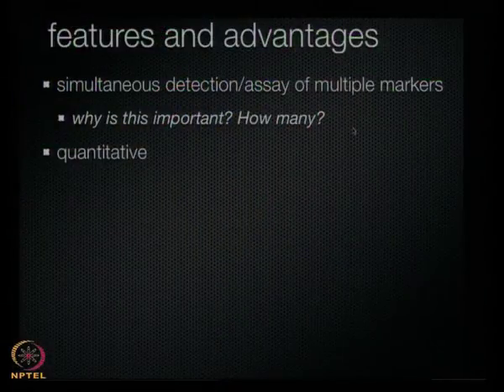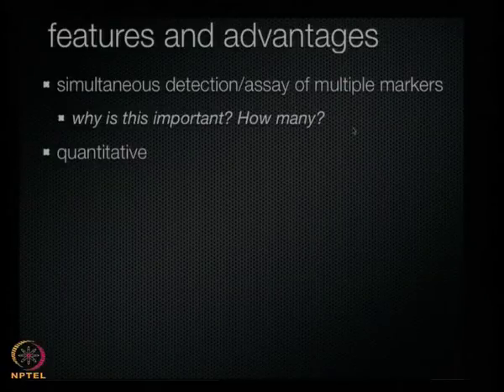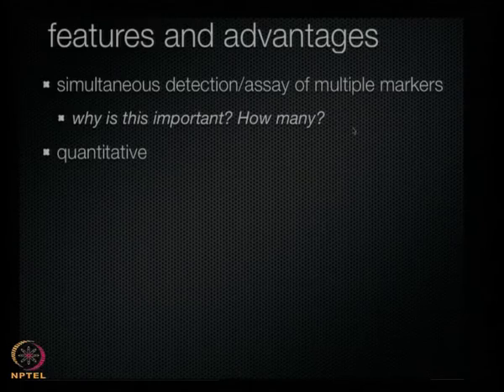Sure. So the approach is also quantitative, because, of course, the intensity of the signal is proportional to the amount of the material that's gone down. And of course, you have to run calibration curves to keep the standards going. As we mentioned earlier, there are few false positives, because if things don't fall down on a grating, then it's just not going to be measured. And the information is real-time. Again, that's characteristic of all label-free techniques. It's a real-time measurement of the actual interaction, and therefore you can extract from it kinetic information, binding information.